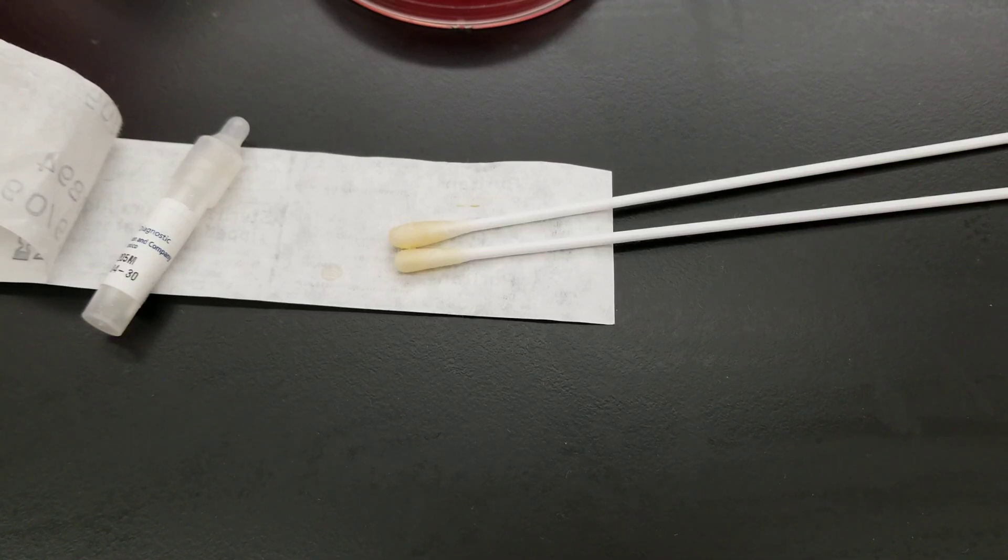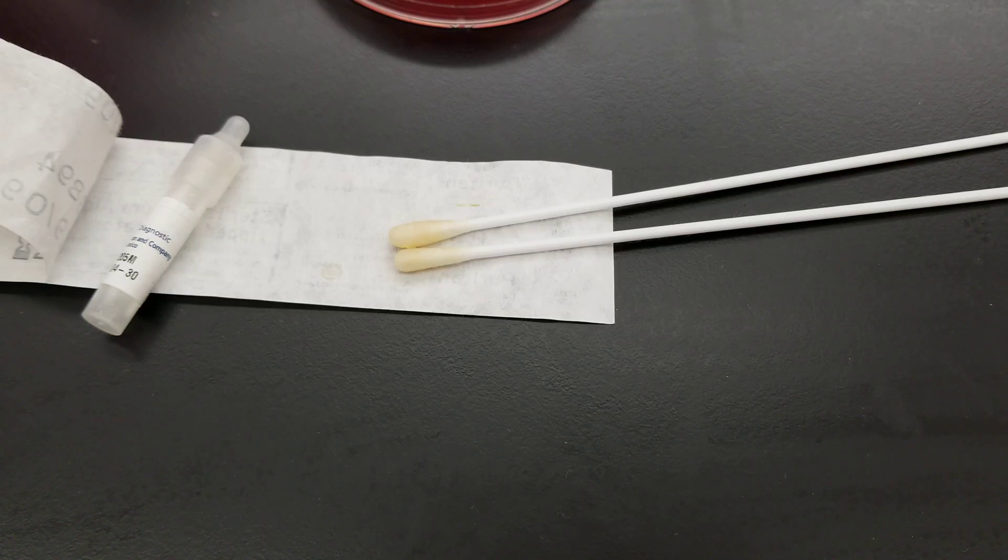Some of you might be screaming at the screen. The reason I'm showing you the oxidase reaction from micrococcus luteus is because it should be positive for modified oxidase, but not the oxidase that we have in our classroom. So even though it is considered oxidase positive, it's not with the reagent that we have in our classroom. You use a modified oxidase reagent and there's an impregnated disc that you can use, and that's not what we have. So it's a completely different reagent that's used, and that's why you're seeing a negative here. So when you see that in the classroom, please don't get concerned or worried.